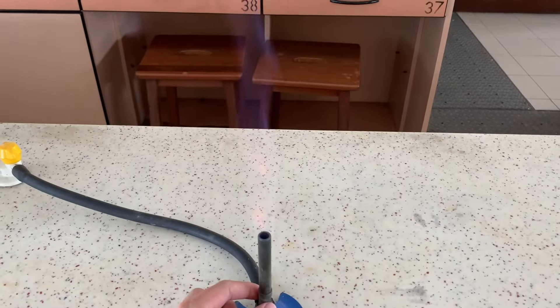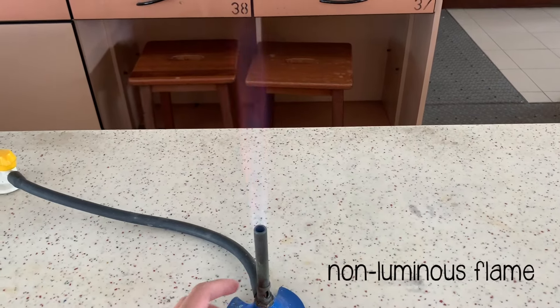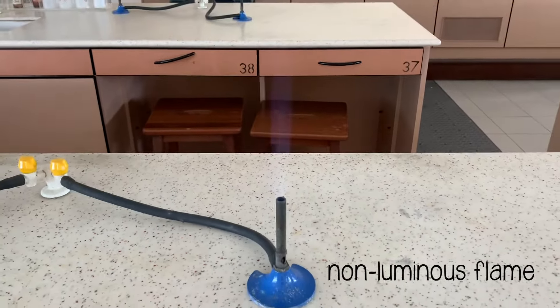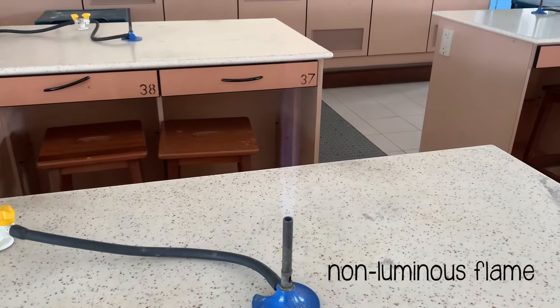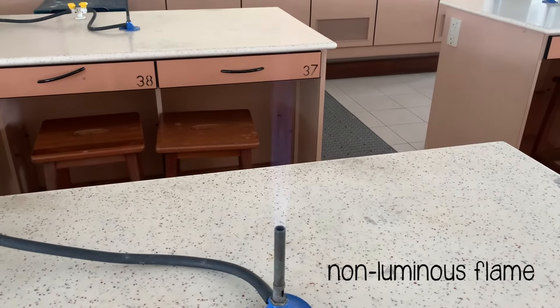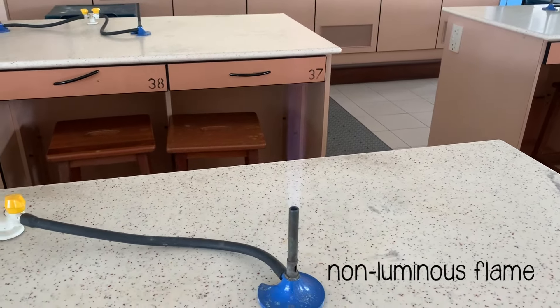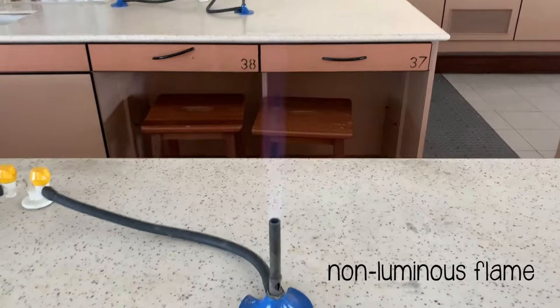We can open the air hole slightly once the flame is lit to obtain a non-luminous flame. This is a blue flame that burns steadily. The non-luminous flame is hotter than the luminous flame, and it burns more cleanly and doesn't leave behind any carbon residue.